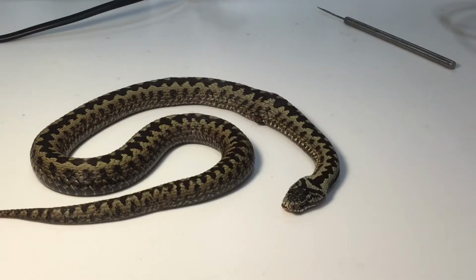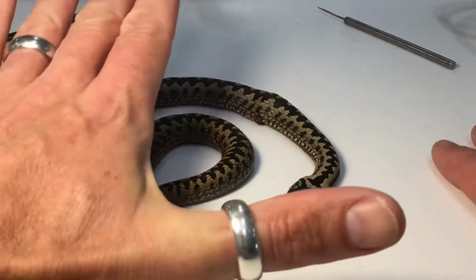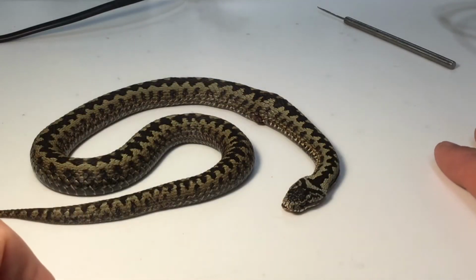So this is the adder, Vipera berus. I just thought I would show you the outside features of the snake before I start to preserve it. So you can see they're actually quite short. You can see a sort of scale here. So here's my hand. So they're not particularly long.